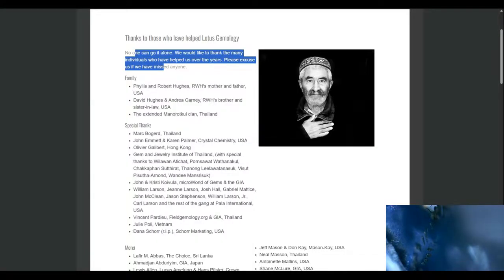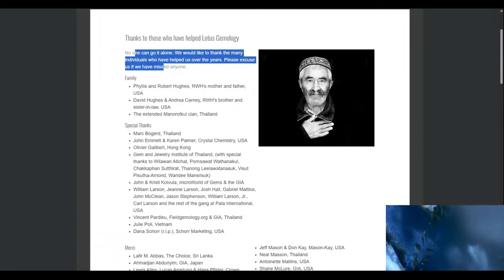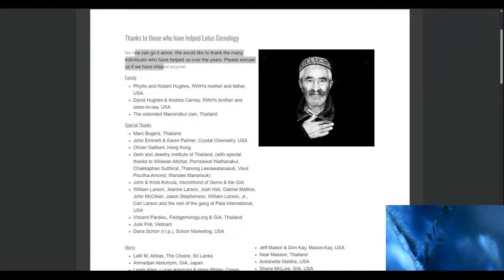I mean, I'm all in it for the technology. I want to know what they use and what is in between what I use and they use. And you might get something affordable happen. You might be able to produce something that is almost as good as theirs, in between. The quality will be in between the 10 grand microscope and what I use. But you don't even need anything better than what I use. That's what I've learned. Because there you have it, guys. You can see it live. Boom. There's enough for identification, even for proving. If you want to prove something, if you have an issue, you want to sue someone, you have it right in front of you. Boom, there you have it, right?